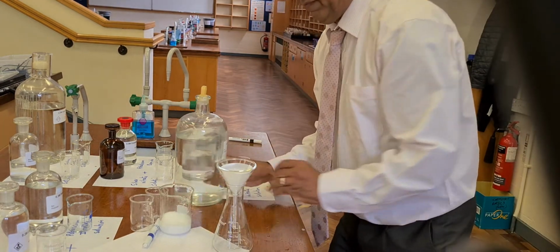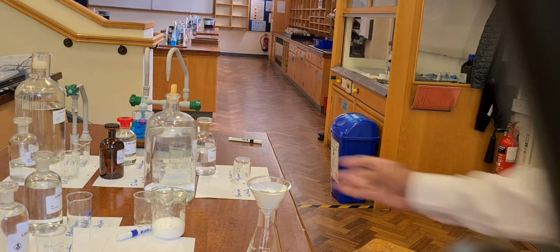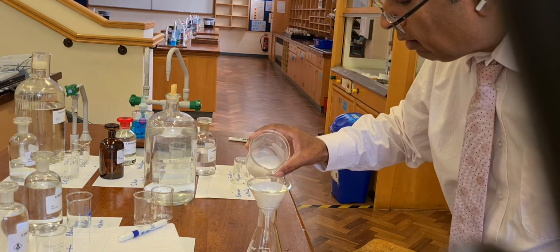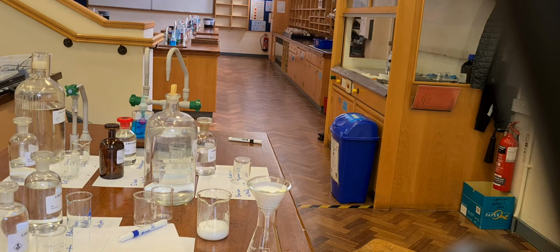Move all these away. Now I'm speeding this along a bit. I'm rushing it just to make the video a bit shorter. But essentially the salt is formed in there and sits on top of the filter paper as a residue.